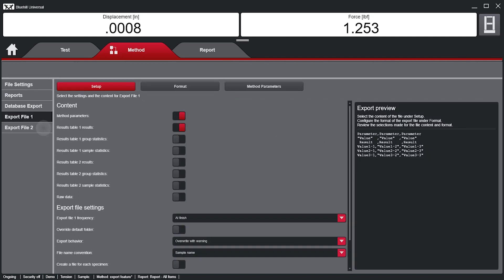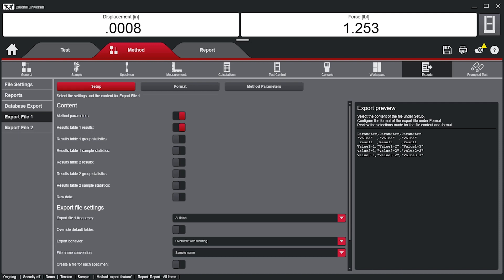Users can also create two separate export files. This can be helpful when two different export formats or export information is required.